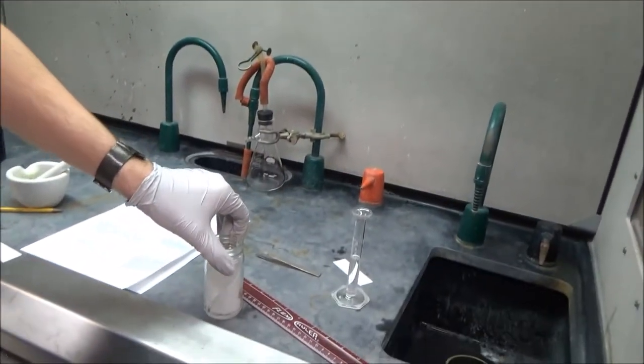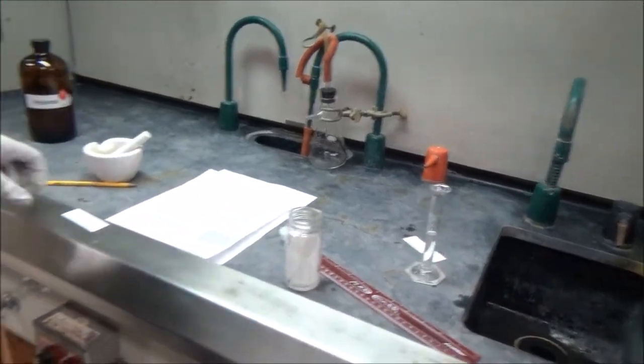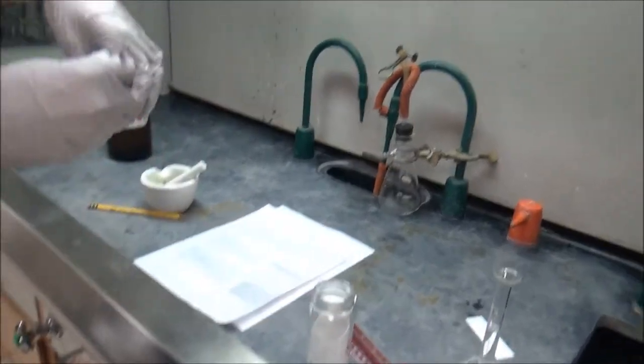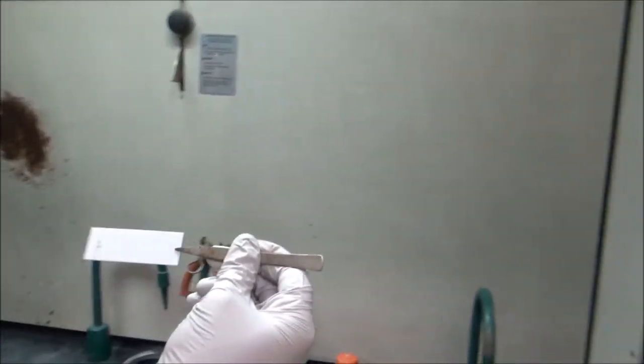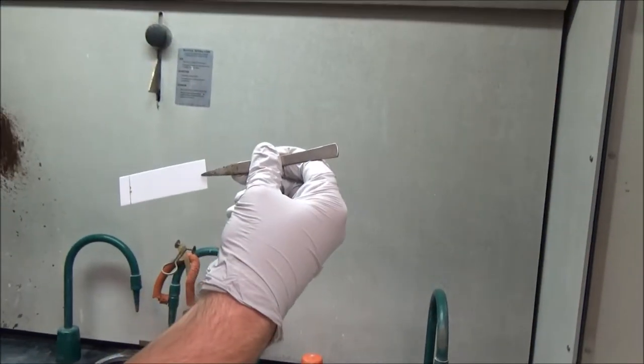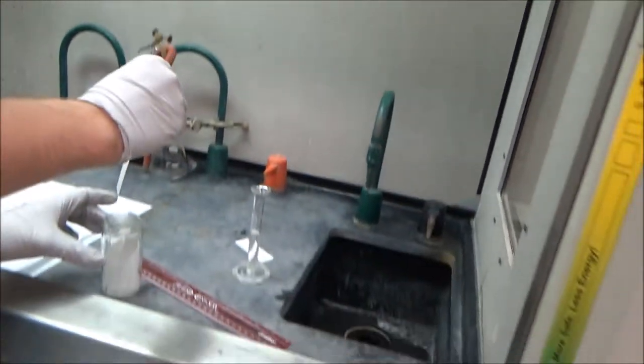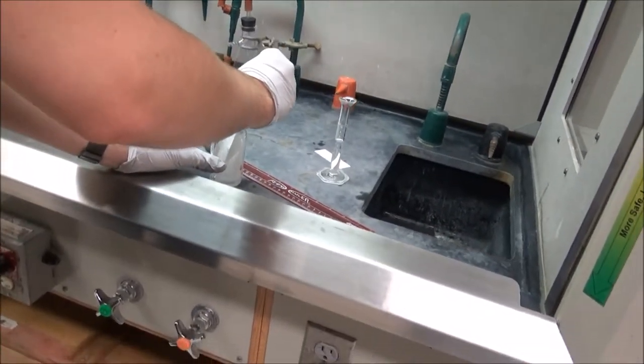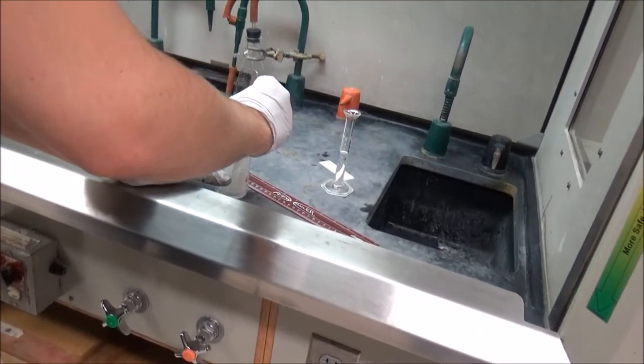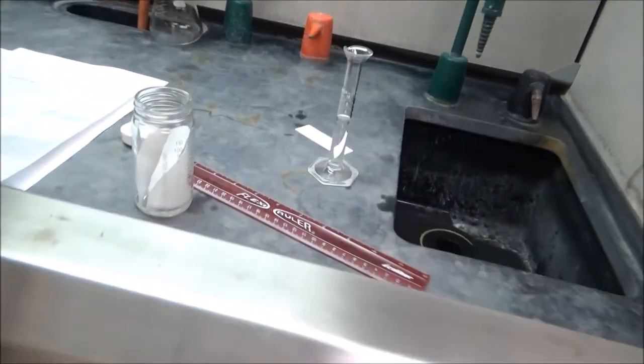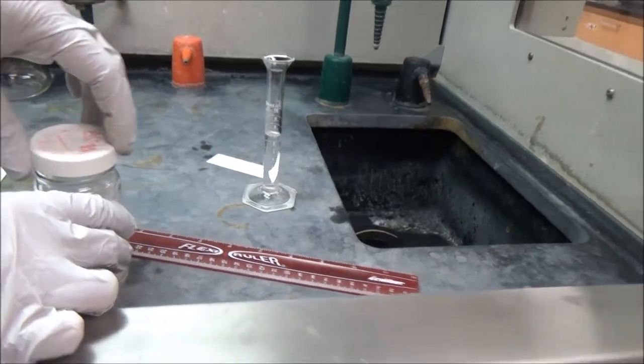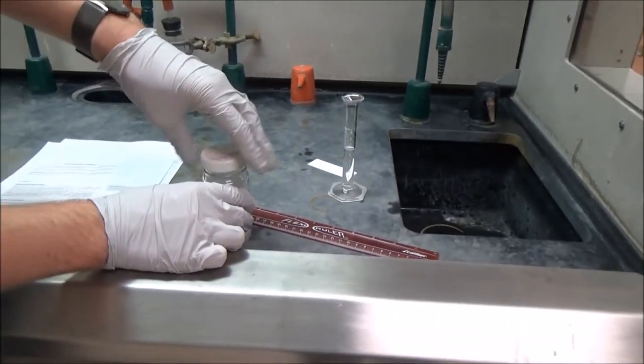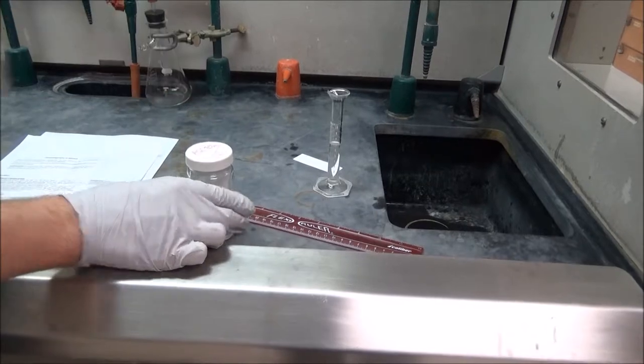Now that that's prepared, I'm ready to immerse my TLC plate in the solvent. I'm going to take this pair of forceps, hold the TLC plate by the top of it, and place it in the solution carefully. Then lean it against the side of the TLC chamber. Then I'm going to put the lid on and let that develop.